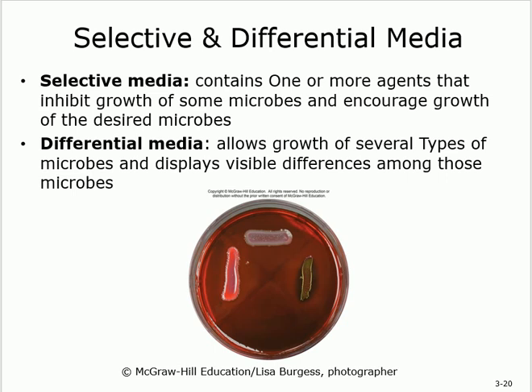Even though you're adding a mix of culture, right? What's going to happen? This media contains growth factors for E. coli and inhibiting factors for anything else. So when you put the sample there, 3-4 types of organisms are going to die, are going to be inhibited. And you're promoting the growth of the E. coli, for example. This is called selective. So to remember it, it selects what to grow and what not to grow, simply.